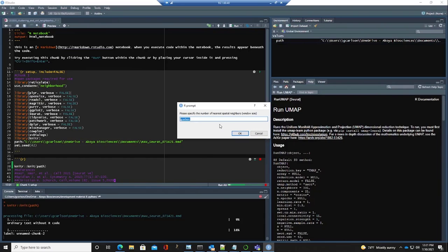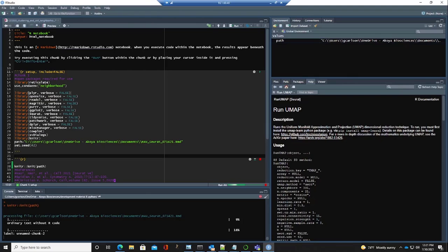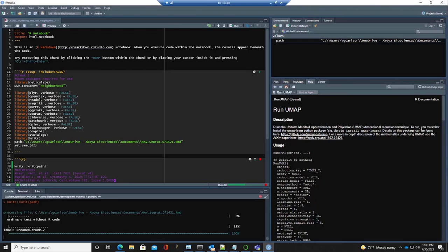We'll then choose the number of nearest spatial neighbors for the cell neighborhoods calculations — we'll explain what this is later — and finally the number of cell neighborhoods we want to calculate. This script is going to go forward and perform all of our clustering and cell neighborhood calculations. We won't need to do anything more with this.